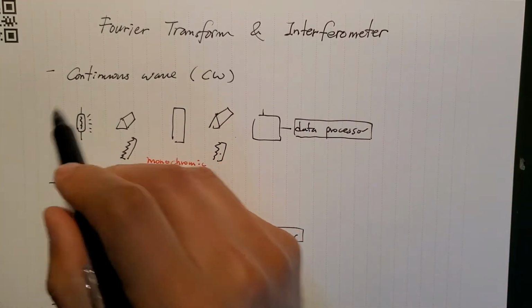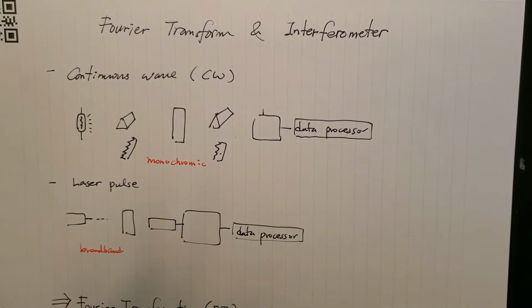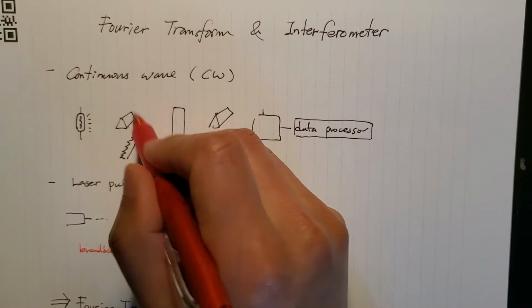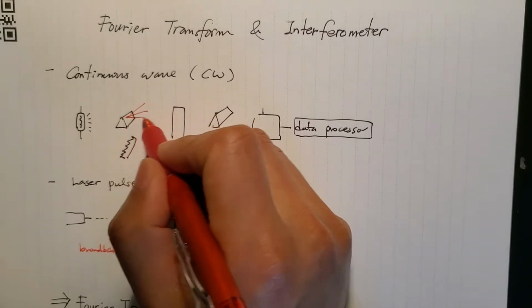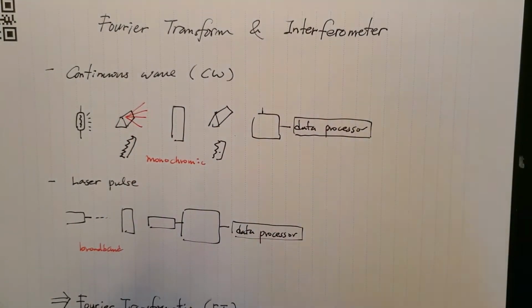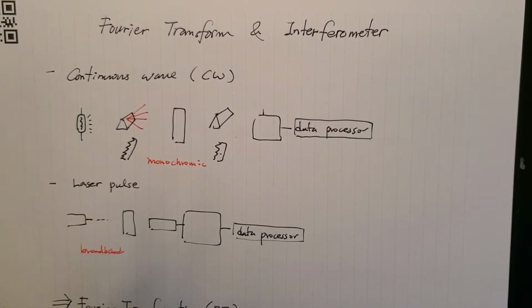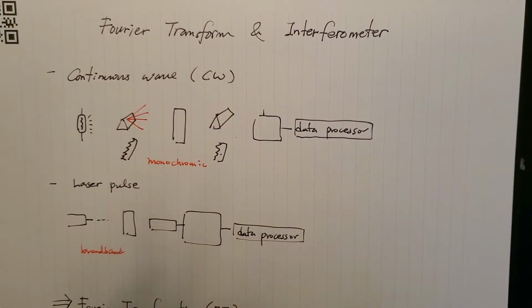So the light source is emitting a variety of wavelengths of your choice of bulbs, depending on what you want to study, like we discussed before. We used to have a prism that can split the wavelength, or we can use movable small mirror gratings, or you can call it a wavelength selector.